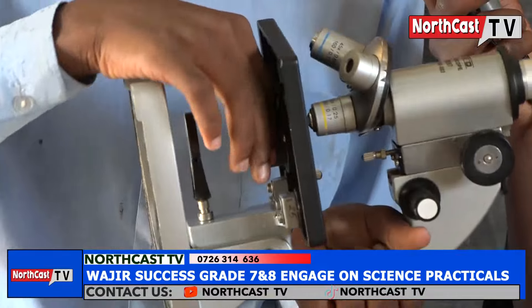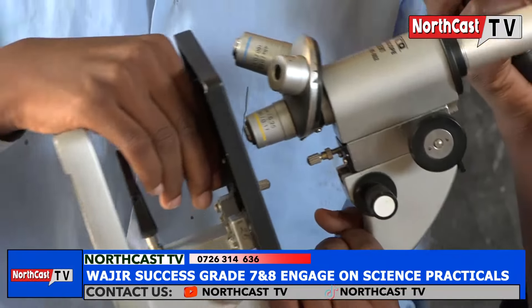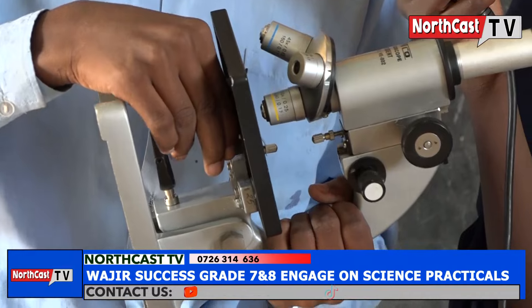The other one is the diaphragm. The diaphragm controls the amount of light passing through the condenser onto the stage.